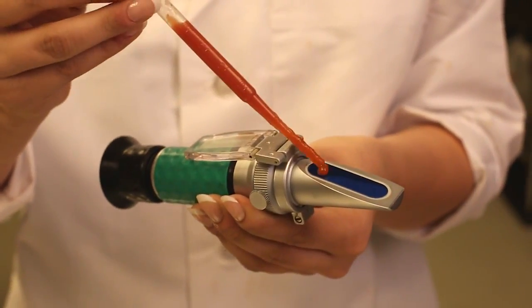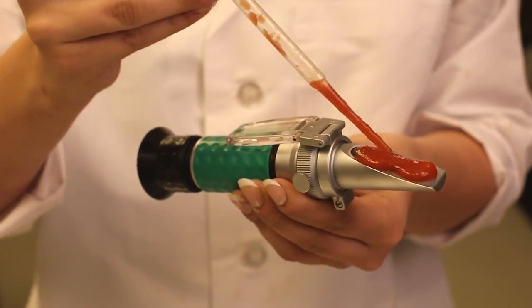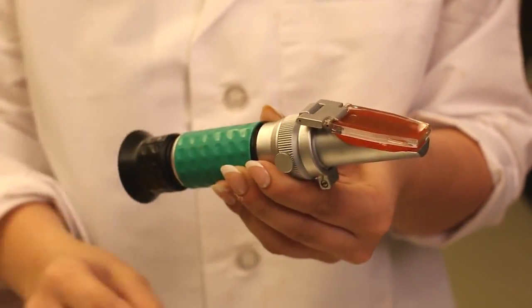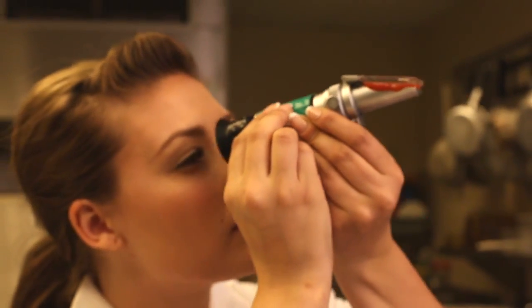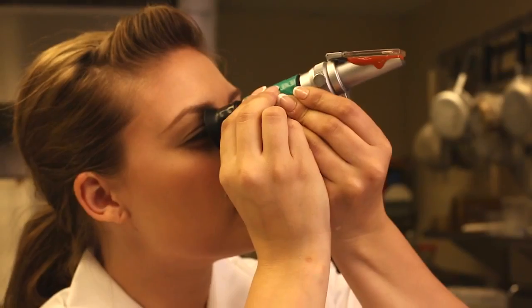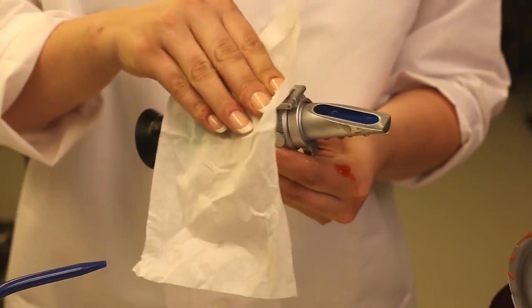Next, we apply the product we will be testing to the prism. It is important to cover the entire prism making sure there are no air pockets or gaps. Next, we close the daylight plate and look into the light. At this point, we should see the scale reading go up from zero to the actual reading of the percent of tomato solids. Once this test is complete, the prism should be cleaned with distilled water and the prism dried with the wipers before putting away the unit.